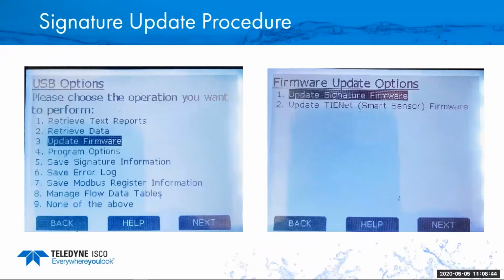This will include a variety of functions and features available to you, such as the ability to retrieve text reports from the unit, the ability to retrieve the data, and for our purposes here, the option to update your firmware.